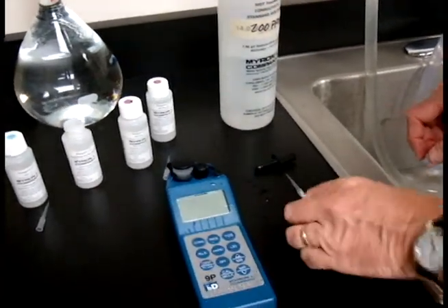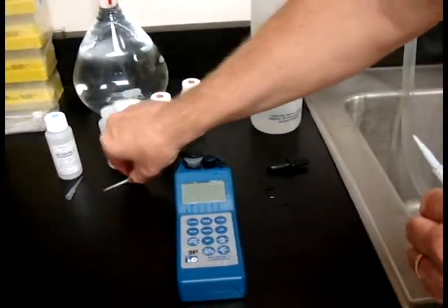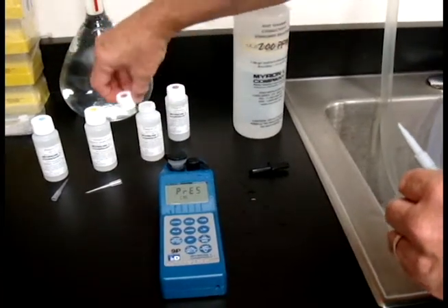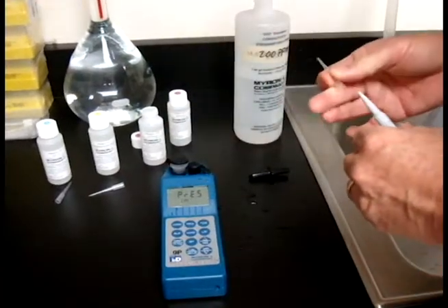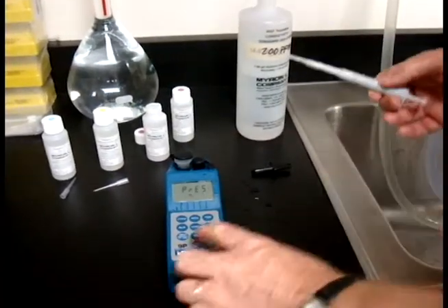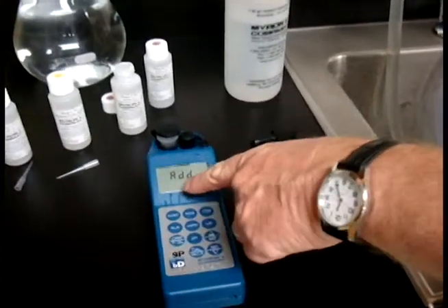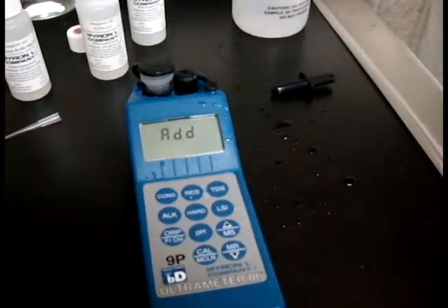Before I hit Cal, I'm going to get ready for the next step — which means I remove this tip and put the cap on. In this case we're going to be using EDTA LC. Put that tip on and hit Cal. It's going to say add EDTA LC — see the LC down here? That's the one you want to use.